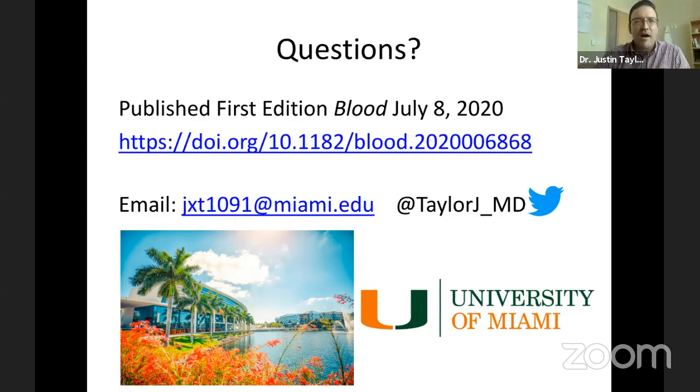And we've done some modeling in animals where they also cause synthetic lethality if you see these splicing factor mutations together. So it was very much intriguing, and we'd had some experience with Mission Bio Tapestry in terms of knowing the power of that for single cell sequencing, and we thought it would be a great way to answer this question.